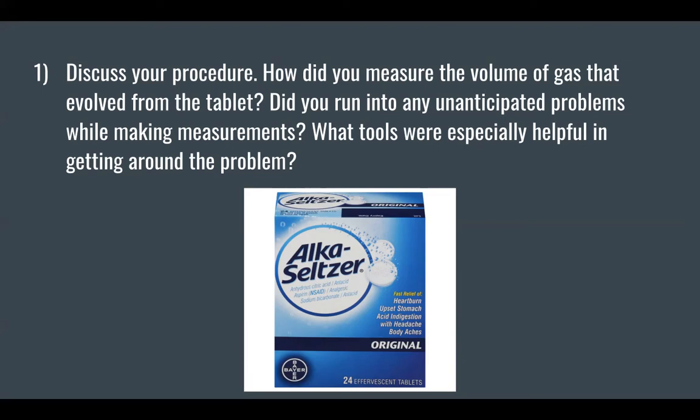Submerging the bag completely underwater was a difficult task, and I used the base of a graduated cylinder to push the bag under. This was useful because my hands couldn't completely submerge the bag without influencing the volume.